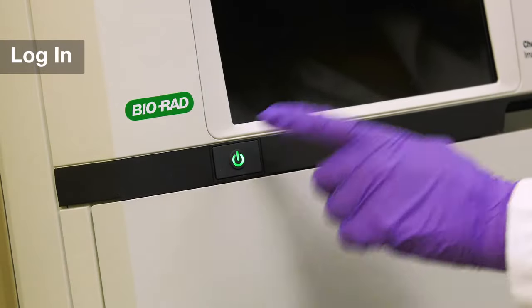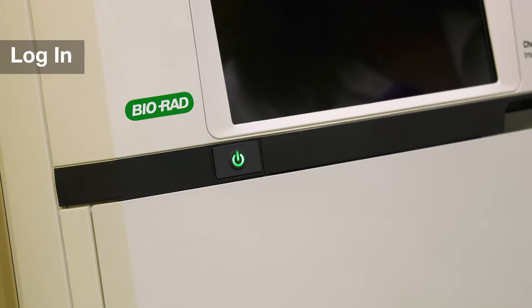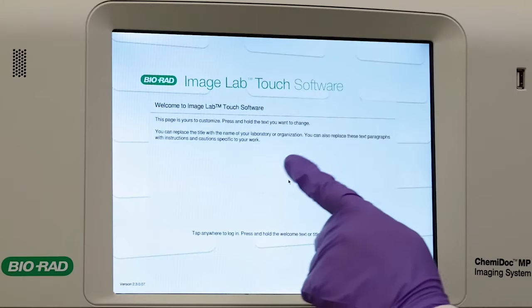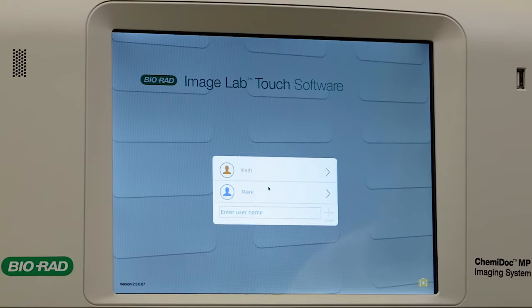To turn your KemiDoc on, push the green button in front of your instrument. When the customizable home screen appears, tap anywhere to bring up the login menu.